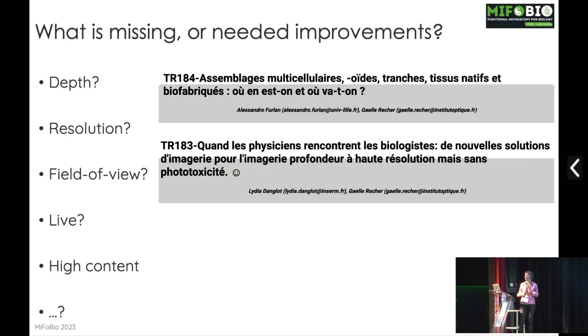Because of course we are more and more looking at tissues that are scattering, full of lipids, and so it's really a nightmare to go through. Do we want to have more resolution? And this, as I told you, if you consider the triangle, then it might compromise the field of view or the length of the duration of the time lapse.